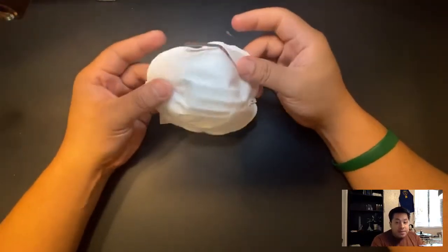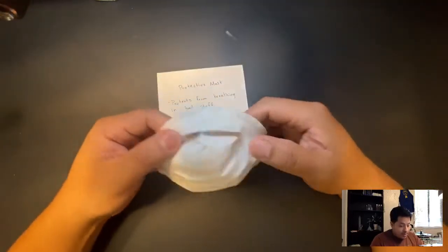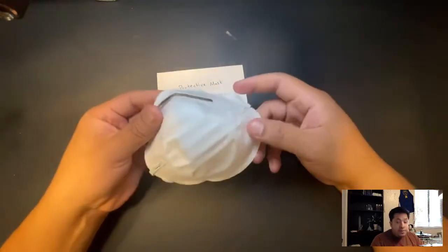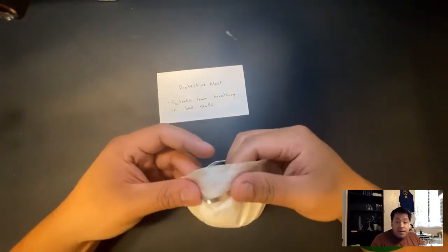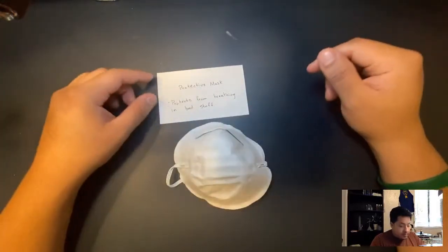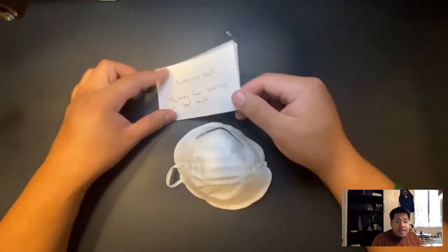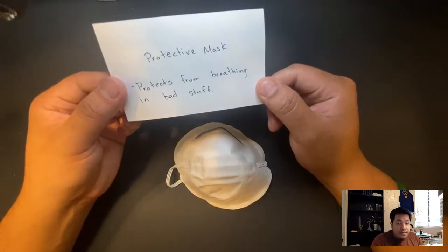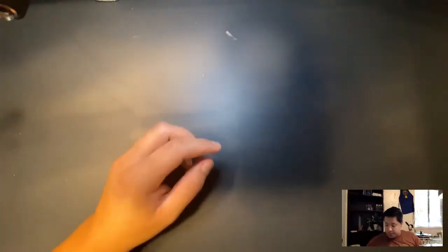The first tool we're going to be talking about is a protective mask. If you're doing woodworking or things like that, you should wear a mask to protect yourself. Whenever you guys go out, you should wear a mask — a protective mask protects from breathing in any kind of bad stuff.